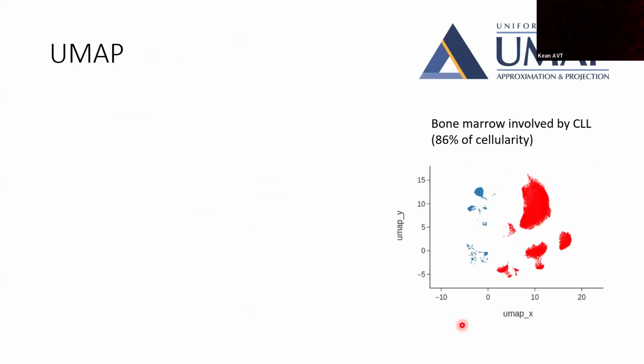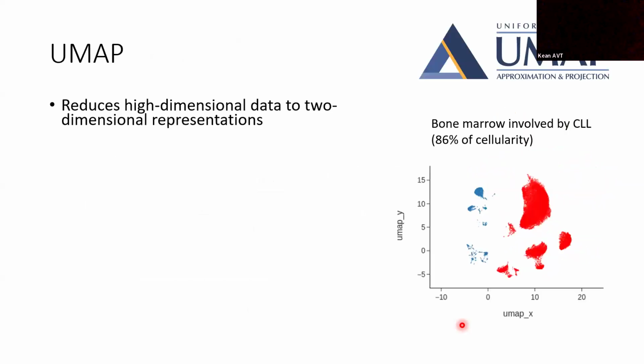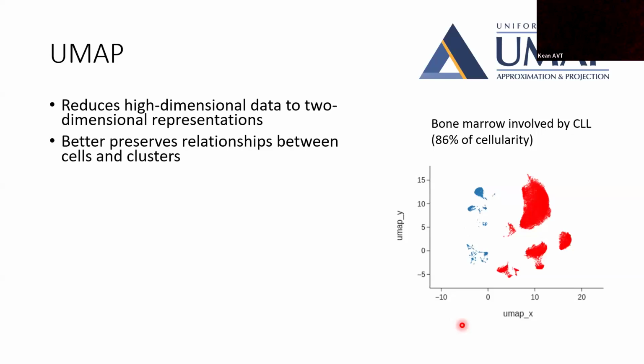And it's available in some commercial software. So UMAP is what I think many more people are using now, and which I also prefer. It does a better job of preserving the overall relationships between cells. So kind of along principal component axes and so forth, you can think of kind of on larger scales and smaller scales.